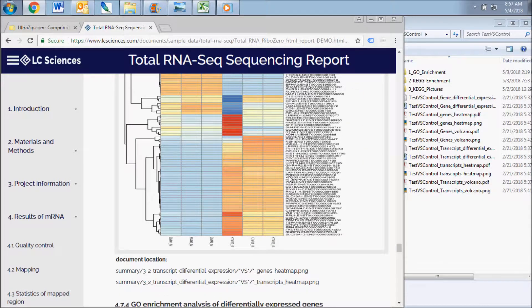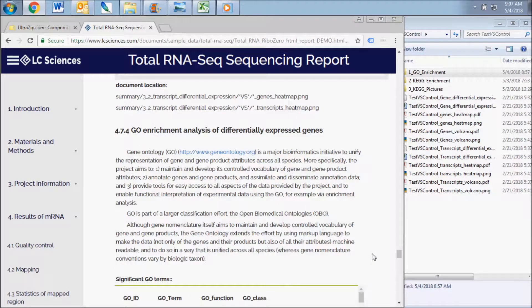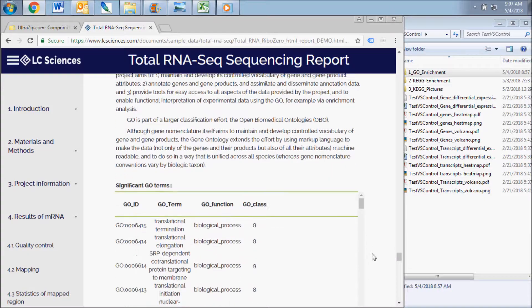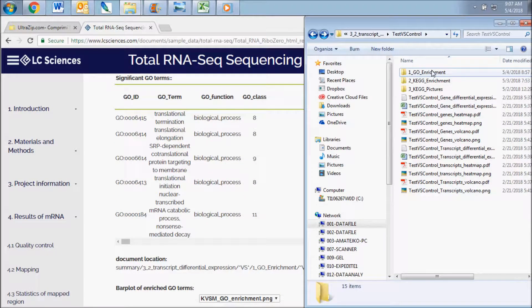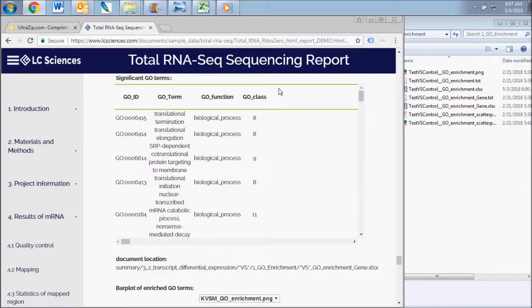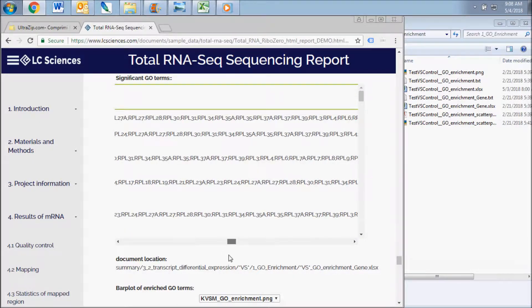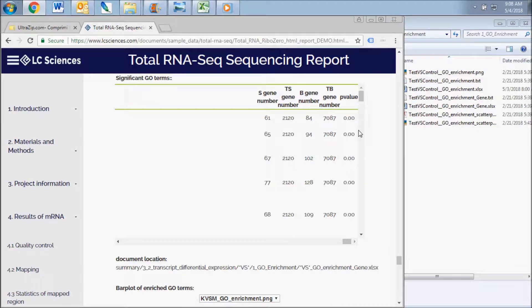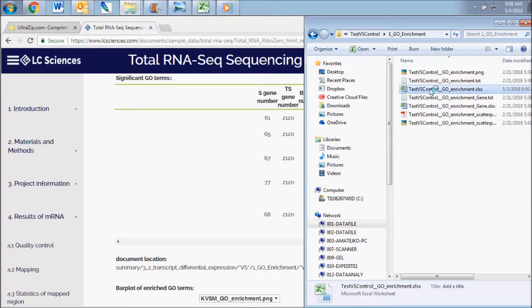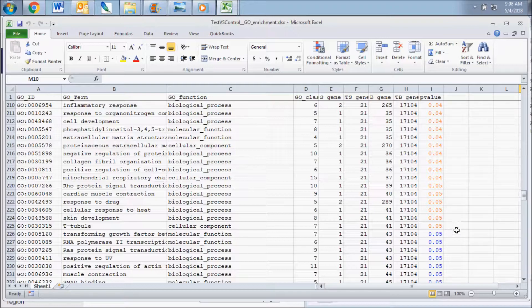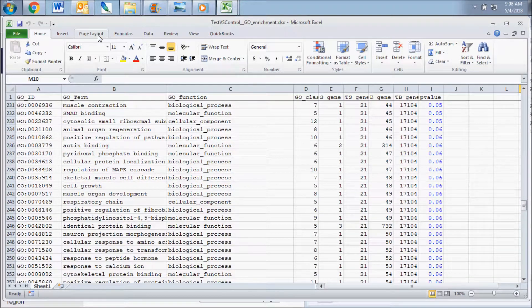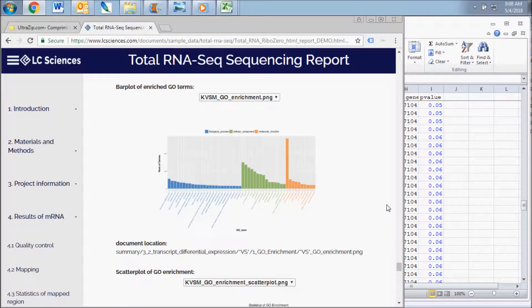The next results subsection displays the gene ontology enrichment analysis of the differentially expressed genes. This data is contained in the GO enrichment subfolder of the group comparison folder. It includes a list of the significantly enriched GO terms based on the differential expression of genes and transcripts within this comparison. The purpose of this analysis is to enable functional interpretation of the experimental expression data. A p-value is included as a measure of significance for each term, calculated by the equation defined in the report. Those GO terms with a p-value less than 0.05 were defined as significant GO terms. A bar plot and a scatter plot are included for visualization of the GO enriched terms for each comparison.